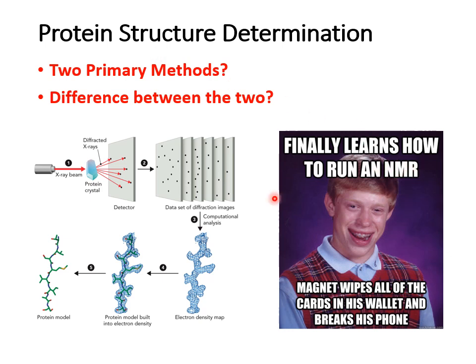NMR stands for nuclear magnetic resonance spectroscopy. I always mess up that word. X-ray crystallography is basically relying on the diffraction of X-rays by protein crystals. And NMR is exploiting magnetic properties of atoms. Now, the big difference is that NMR is capable of revealing dynamic or changing structure of a protein, whereas X-ray crystallography is only going to give you a static model, a static structure analysis.